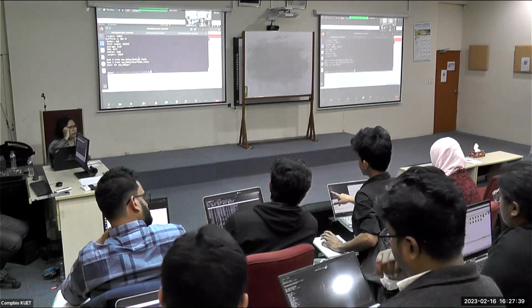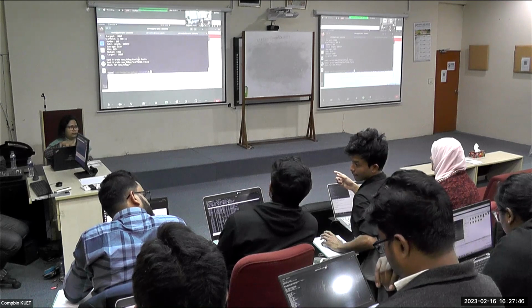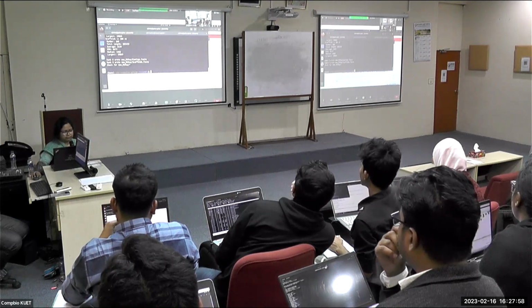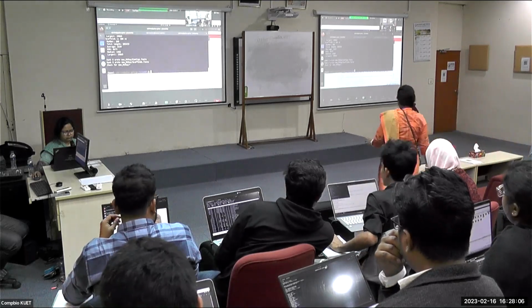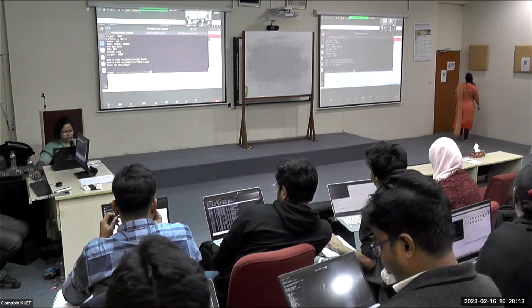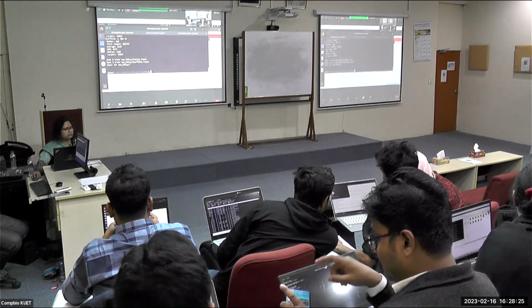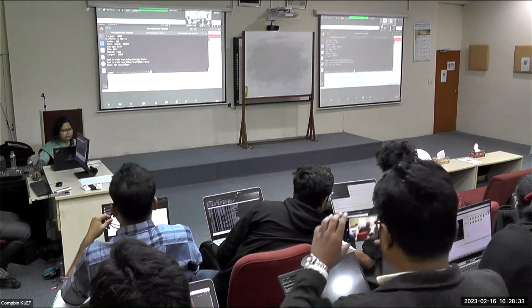So the main output of the assembly is the contig and the scaffold, these two files. So you remember the contig and scaffold? Contig is the consensus sequence that we get from the reads. If we revisit here, this was the contig, the first part of assembling a genome. Then we had the scaffold to remove the gaps, and then the bigger scaffolds.